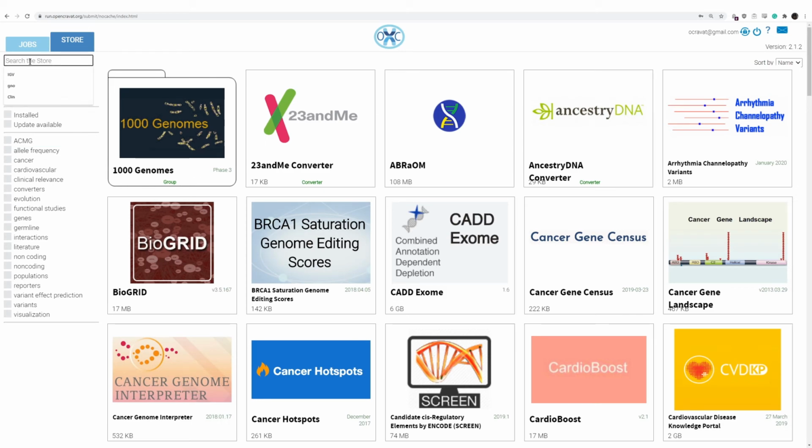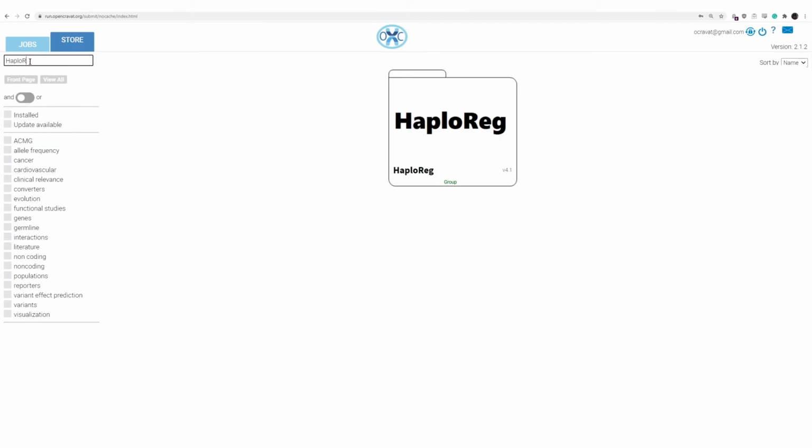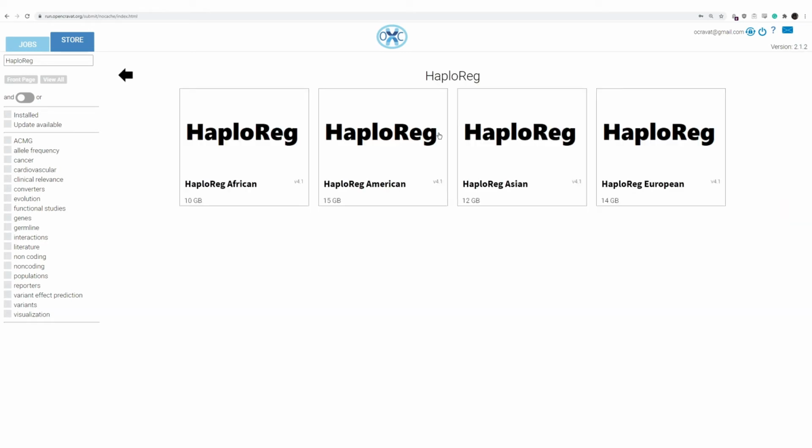Haplotype blocks are highly variable depending upon ancestry, so the haploreg annotator includes haplotype blocks for different populations from the 1000 Genomes Project. These properties do not directly translate to functional or clinical importance for a variant. Instead, these annotations provide insights to the context of a variant by describing the type of DNA sequence being impacted.